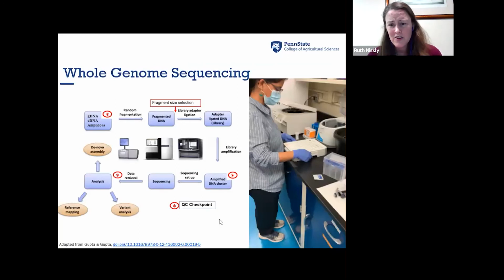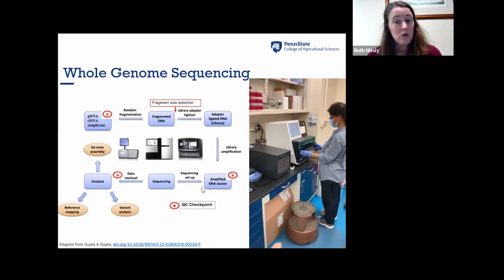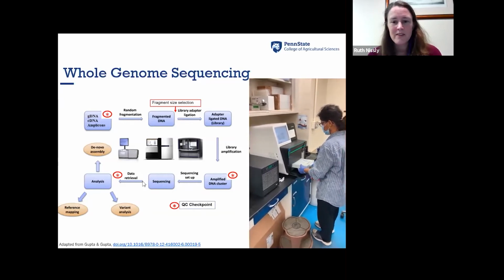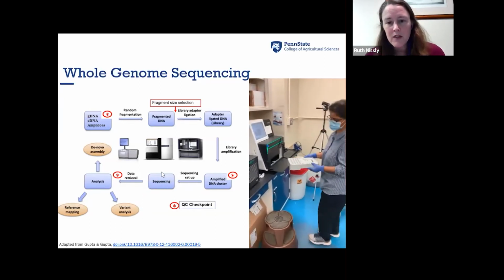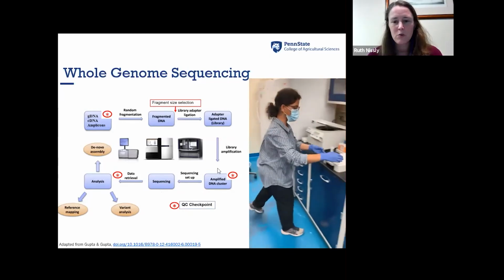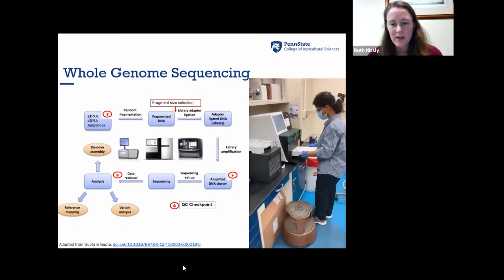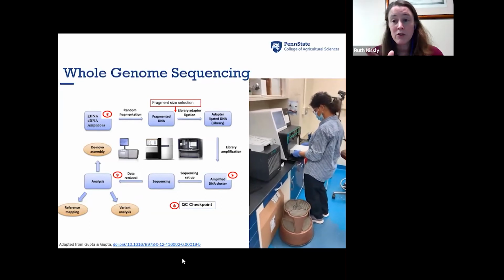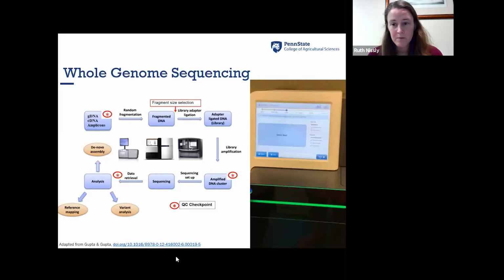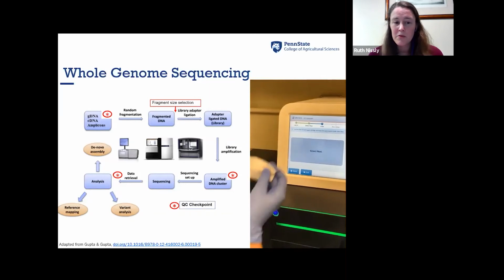The bacteriology section at the Animal Diagnostic Lab partnered with our newly formed genomics core so we could actually sequence our own isolates and get that sequence data that we needed. So following the sequencing process, which takes a couple of days to go through this workflow, we performed data analysis to identify a portion of the bacterial DNA that was unique to Avibacterium paragallinarum. This allowed us to then make a real-time PCR assay.